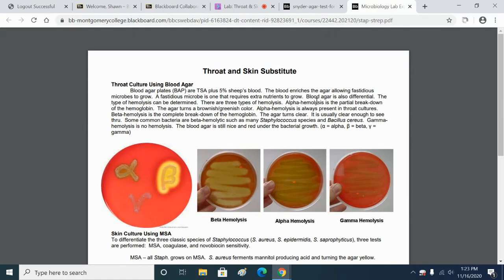Never saw it before. And then another student's plate had a definite fruity smell. It smelled kind of like fruit, which is actually pleasant, except that it's a bad microorganism that causes the fruity smell. It's a pathogen, Pseudomonas aeruginosa.